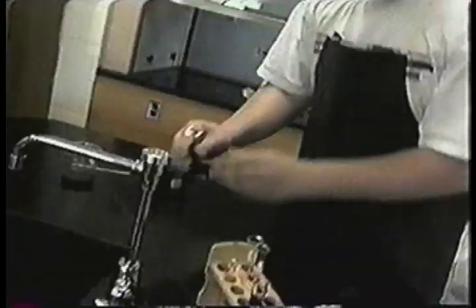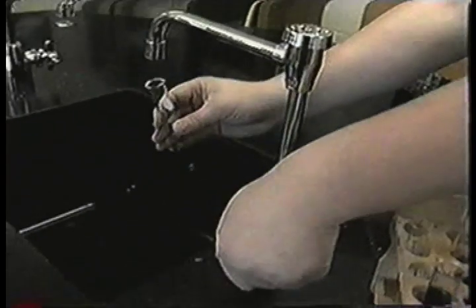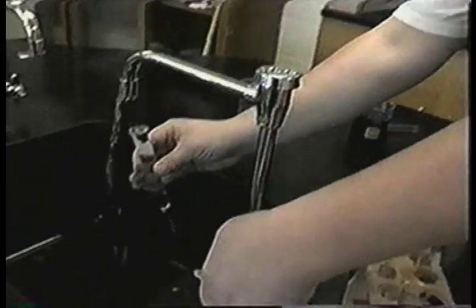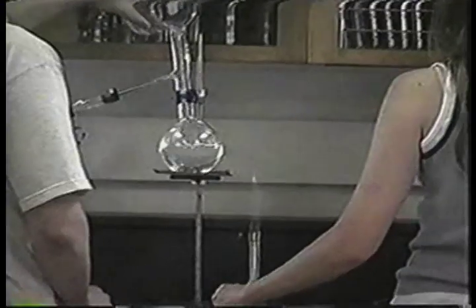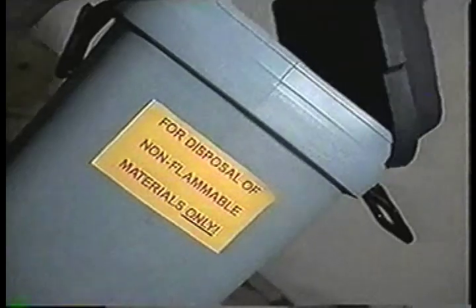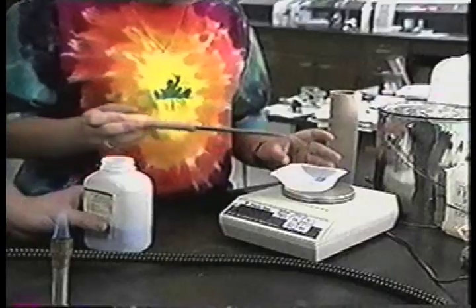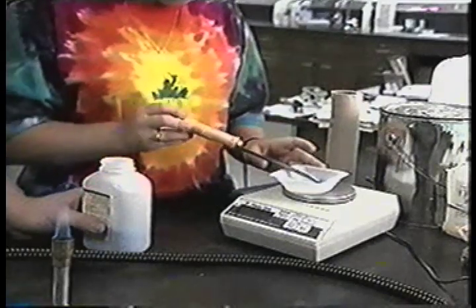In addition to creating another hazard, government regulations are very specific about proper disposal of such substances. The EPA classifies waste by their reaction characteristics. Flammable items go with flammables. Acids with acids. These materials are temporarily disposed of in approved containers for permanent disposal by your teacher or other authorized person.